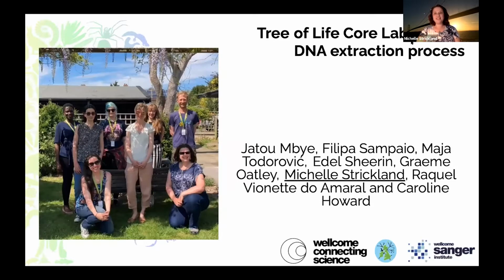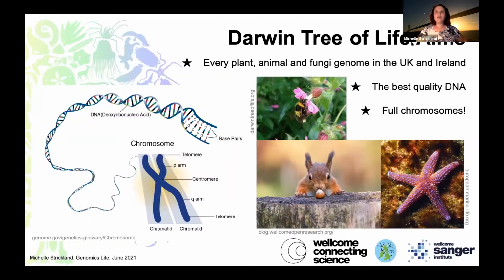Cool. So good afternoon. As I said, I'm Michelle Strickland. I'm part of the core laboratory at the Tree of Life. So what that means is samples come in, we do the processing, and then the DNA goes off for sequencing.